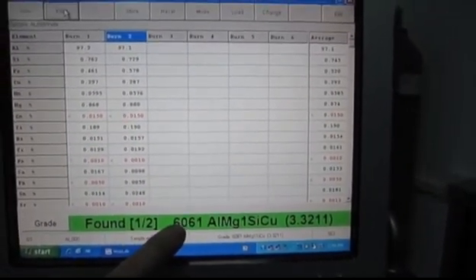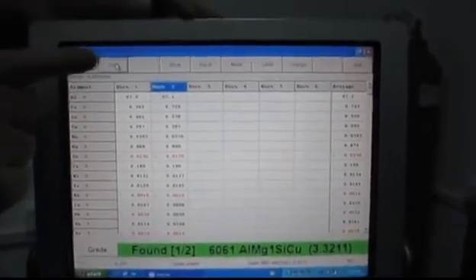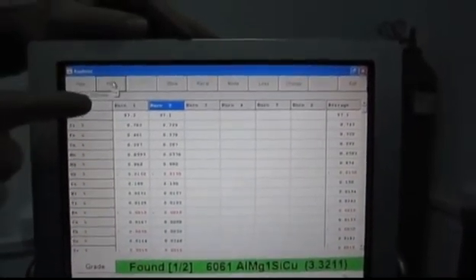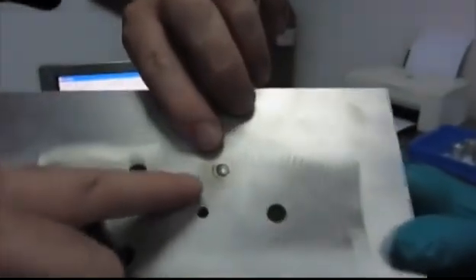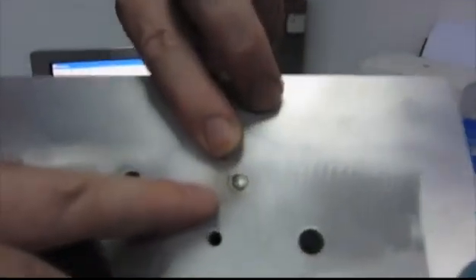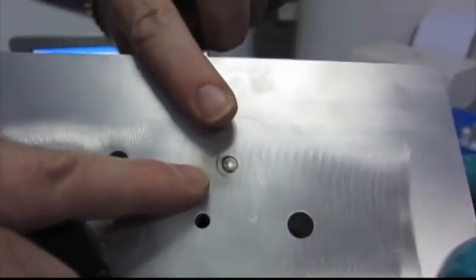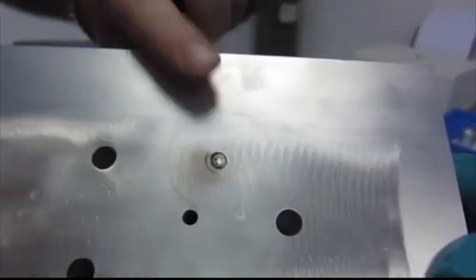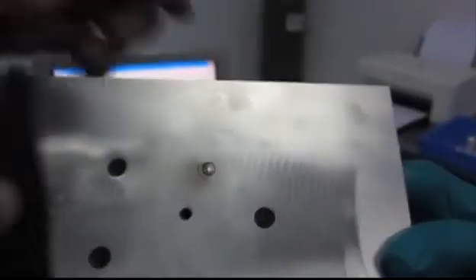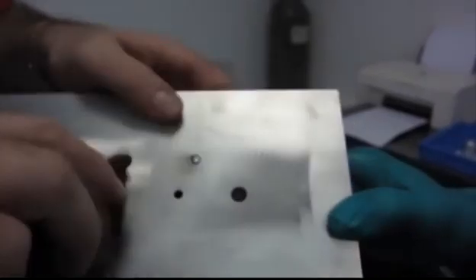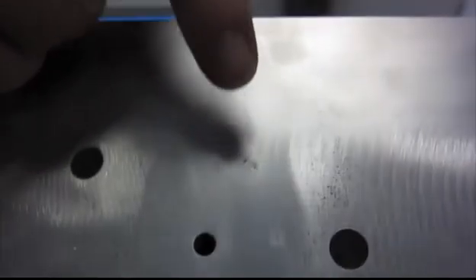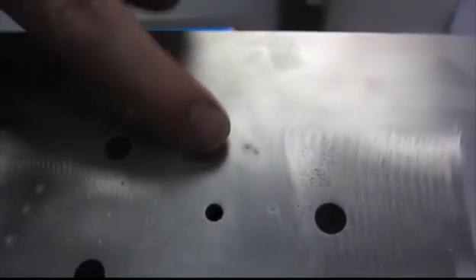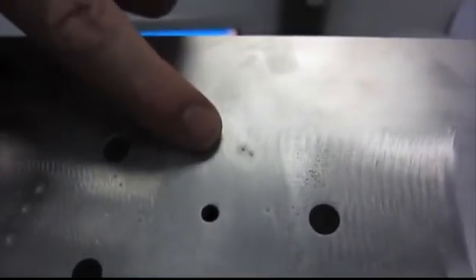So now I'm going to print off that report. And whilst that's printing, that there is the spark site on the finished part. You can see some carburization. I've got some Scotch-Brite and I'm just going to give it a quick rub. As you can see, the witness is almost gone and it's smooth. We will ask customers where they want their spark site.